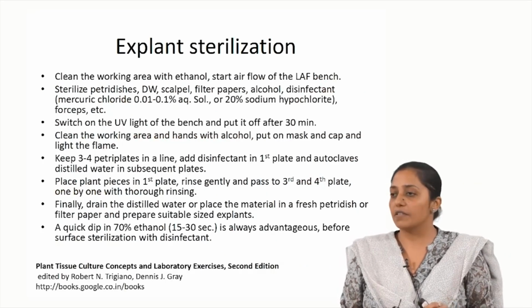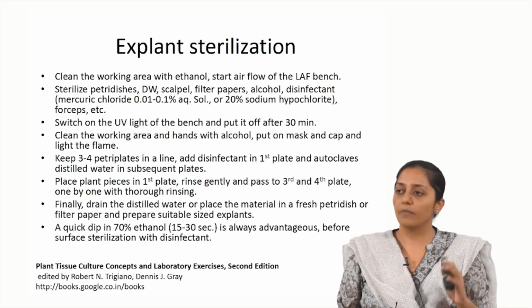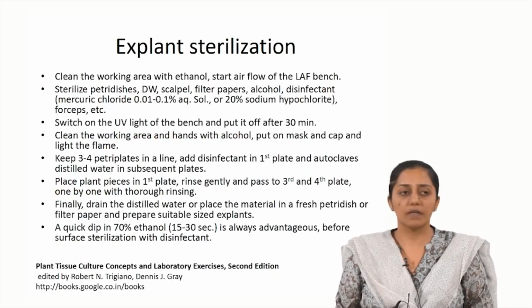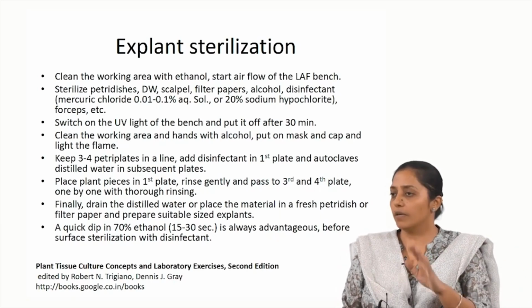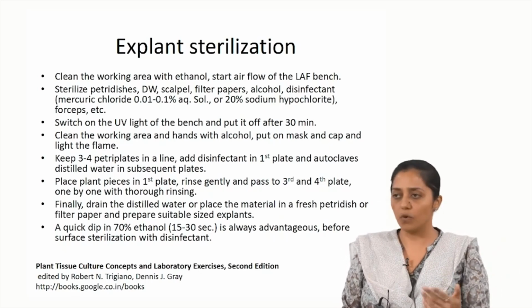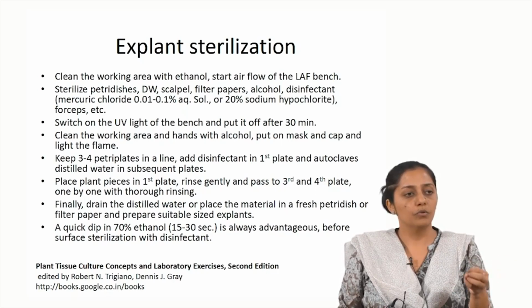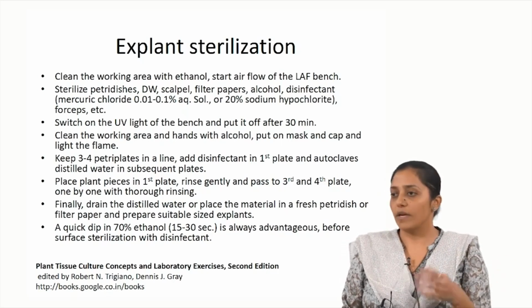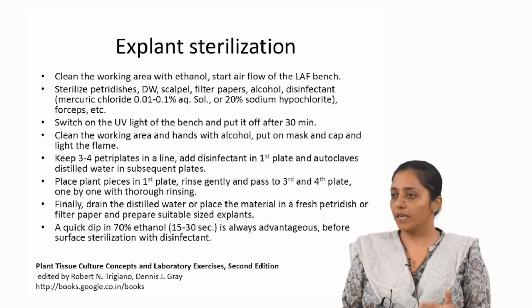So, how is explant sterilization done? This is from a Google book where a simple protocol is given. Generally, you bring the plant material from the outside, you give a continuous water wash, and then a wash with 2% Savlon can also be given along with water. After that you treat it with distilled water to remove the detergent, and then after the treatment with distilled water you take it into the laminar hood.